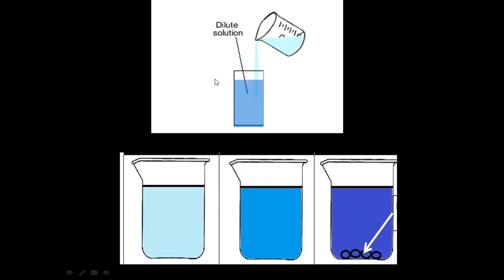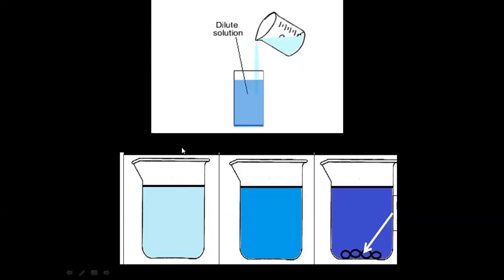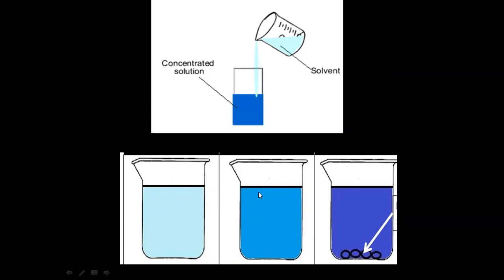So when you make the final volume into a rounded fraction or 100 ml, what will happen for the first person who is getting around 80 ml? You have to add 20 ml of menstruum. When you add 20 ml of fresh menstruum, the concentration of the solution is affected because you required more volume of menstruum. Whereas the second person who is getting 90 ml requires only 10 ml of menstruum, so the concentration is affected little.